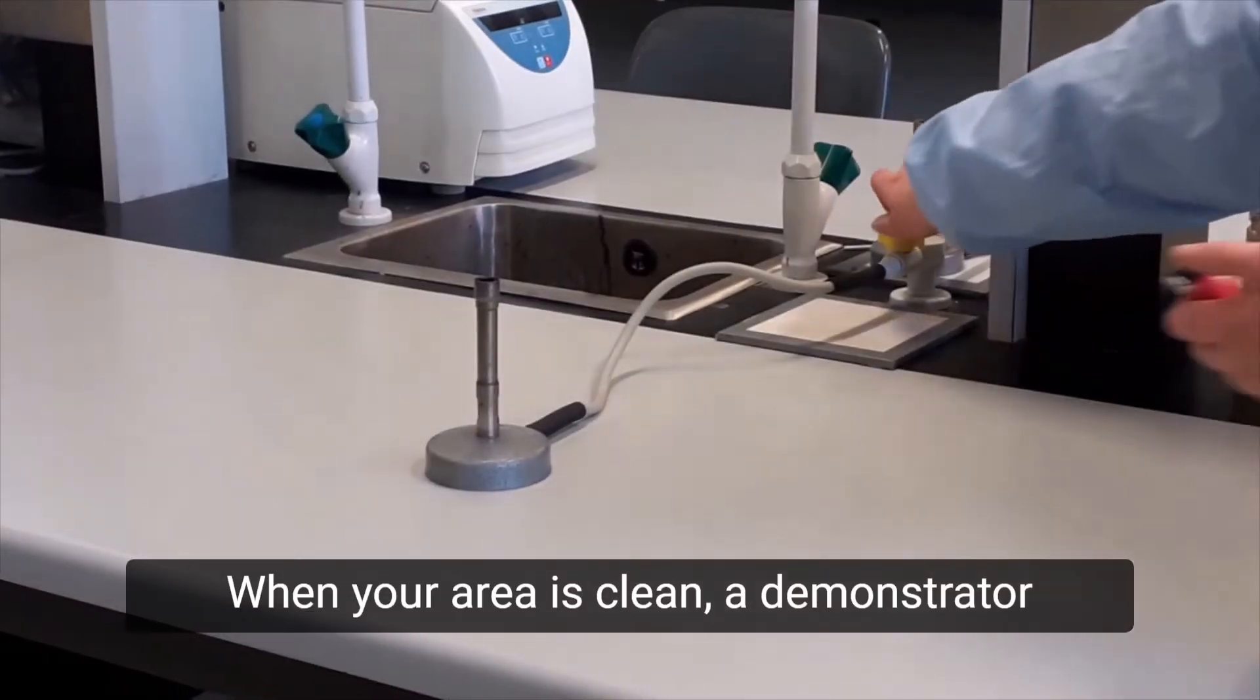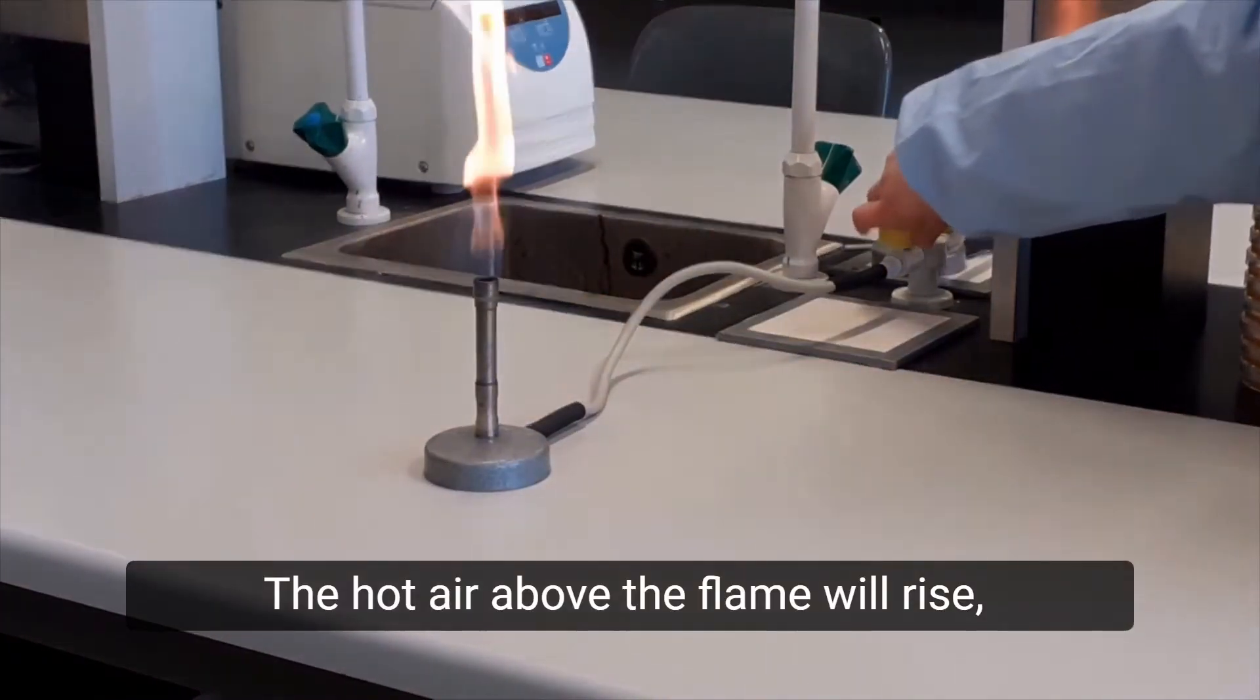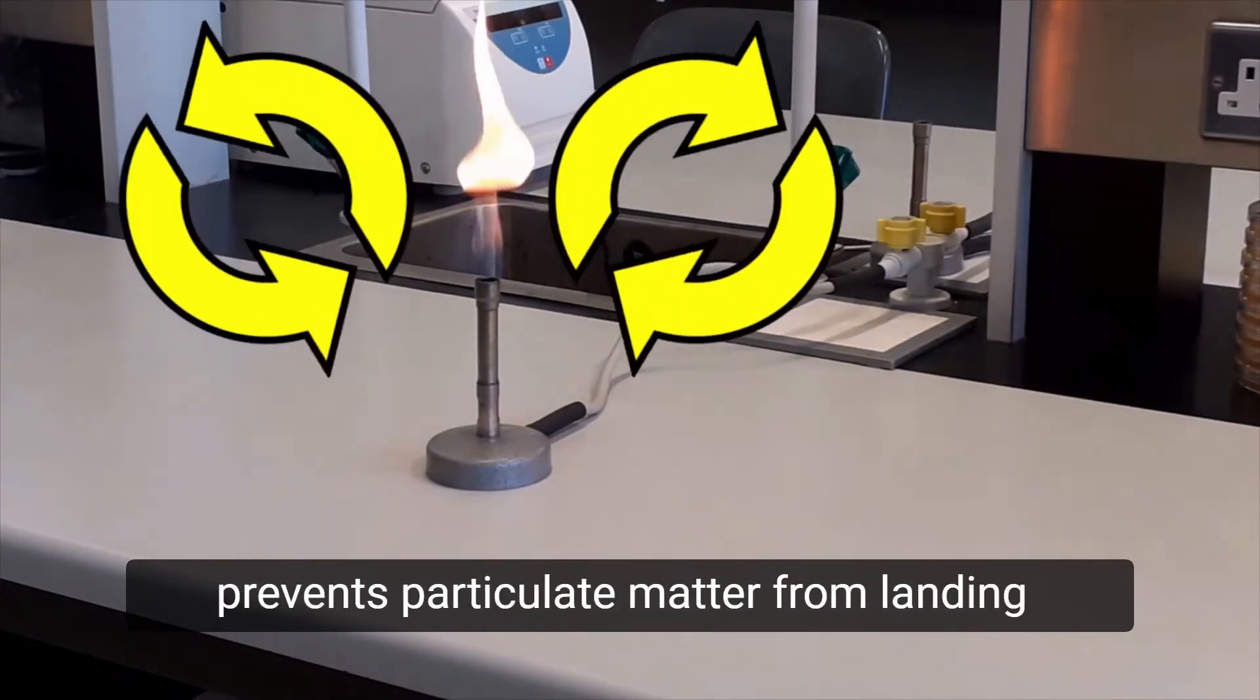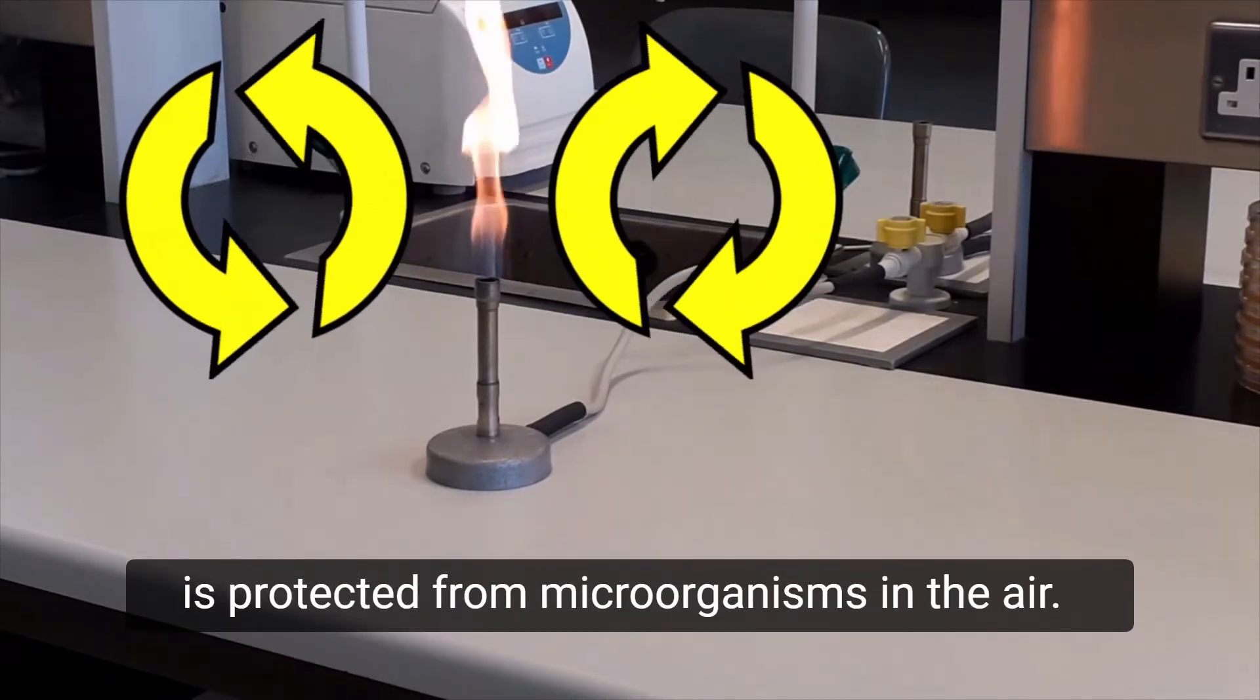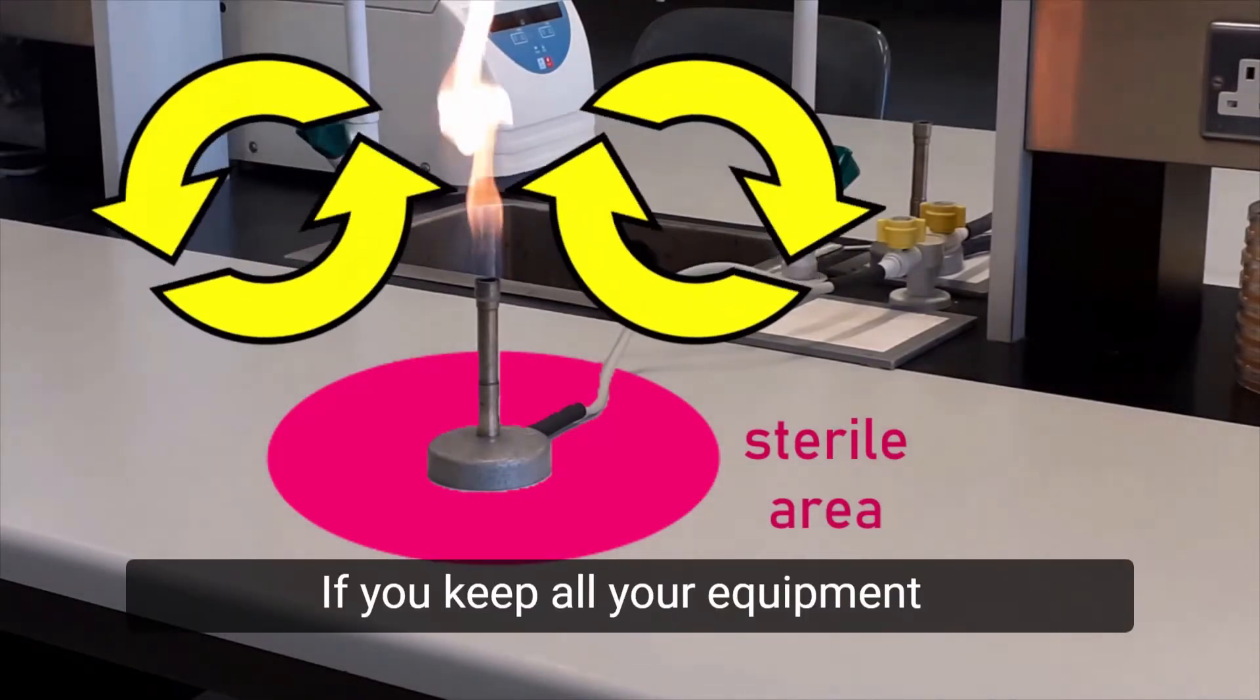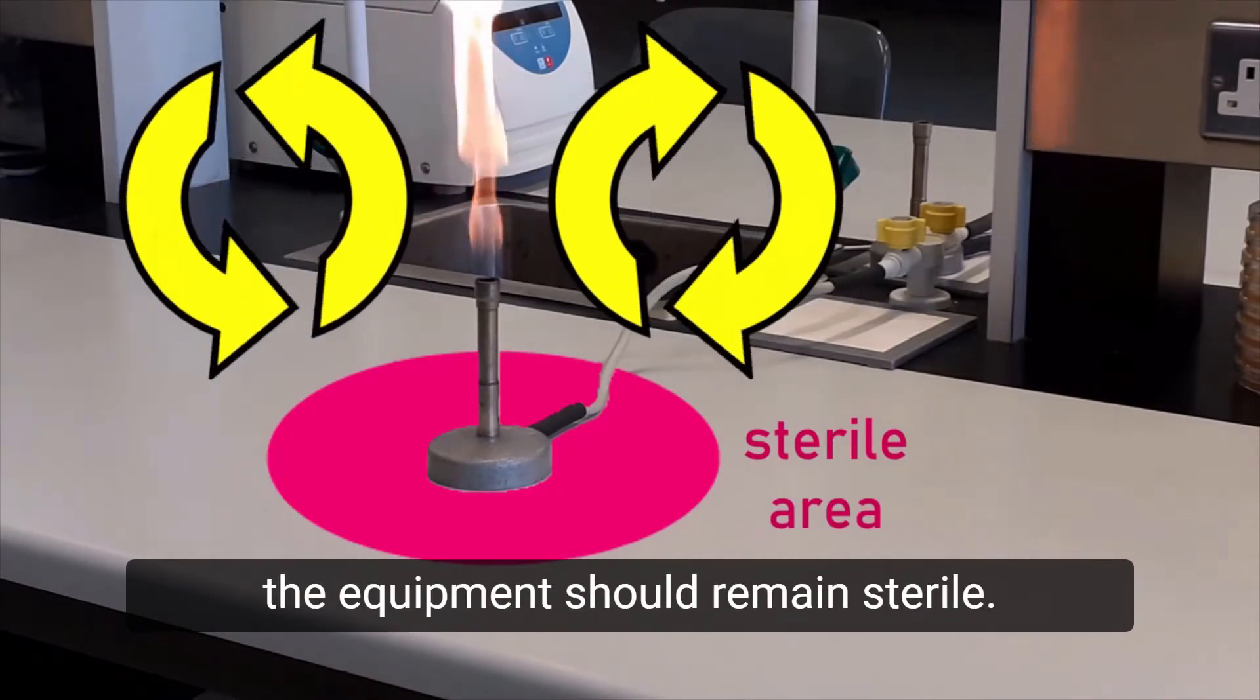When your area is clean, a demonstrator will light your Bunsen burner. The hot air above the flame will rise, creating an updraft that prevents particulate matter from landing next to the Bunsen burner. Therefore, the area immediately around the Bunsen is protected from microorganisms in the air. If you keep all your equipment close to the Bunsen throughout the protocol and you work slowly and carefully, the equipment should remain sterile.